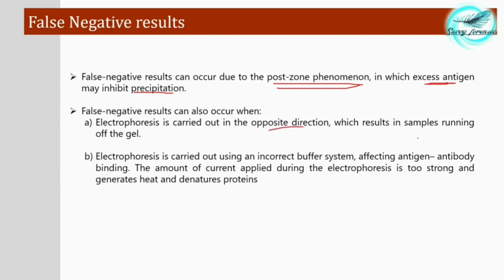False negatives can also occur when electrophoresis is carried out in the opposite direction, causing the sample to run off the gel. Another cause is using an incorrect buffer system, which affects antigen-antibody binding so no proper precipitation occurs. Additionally, if the amount of current applied is too strong, it generates heat that denatures the proteins, also leading to false negative results.